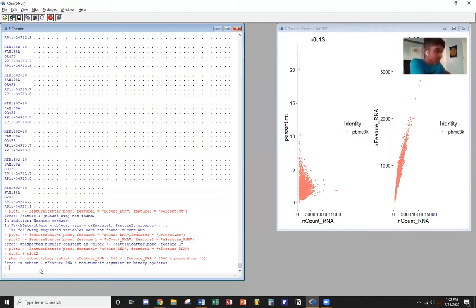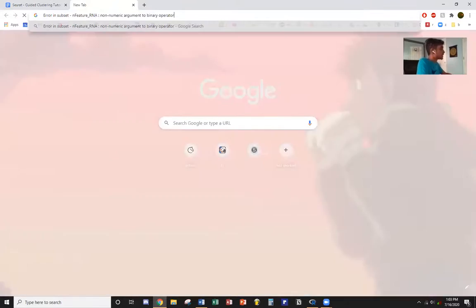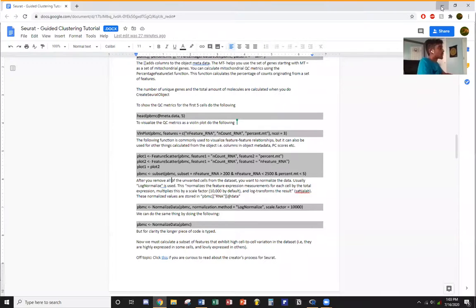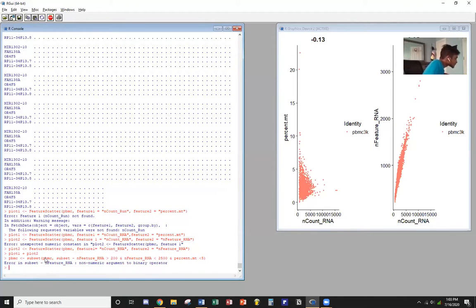Oh my goodness, I'm getting all sorts of errors. So let's find out what the error is. This is very normal. You'll find errors like this, but sometimes you can copy it and then Google the error and see what happened there. But in this case, I think it was simple. I mistyped somewhere. So let's see what that was. Yep, here it is. Instead of putting an equal symbol, I was going a little bit fast and I pressed the minus sign. So fix that.